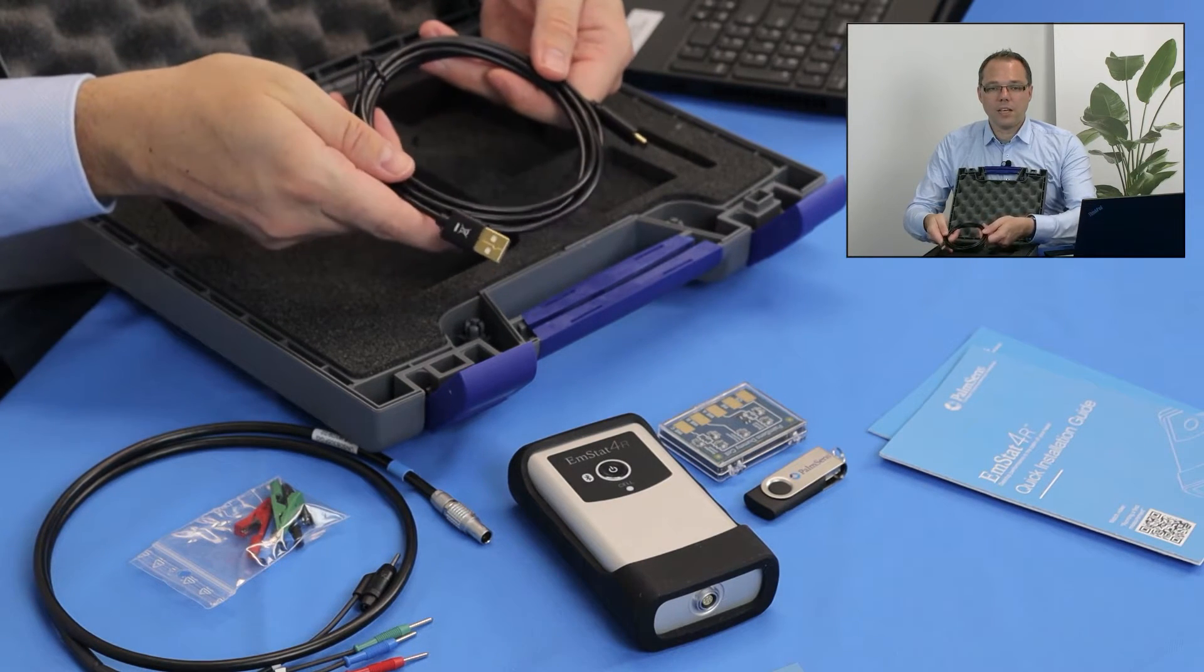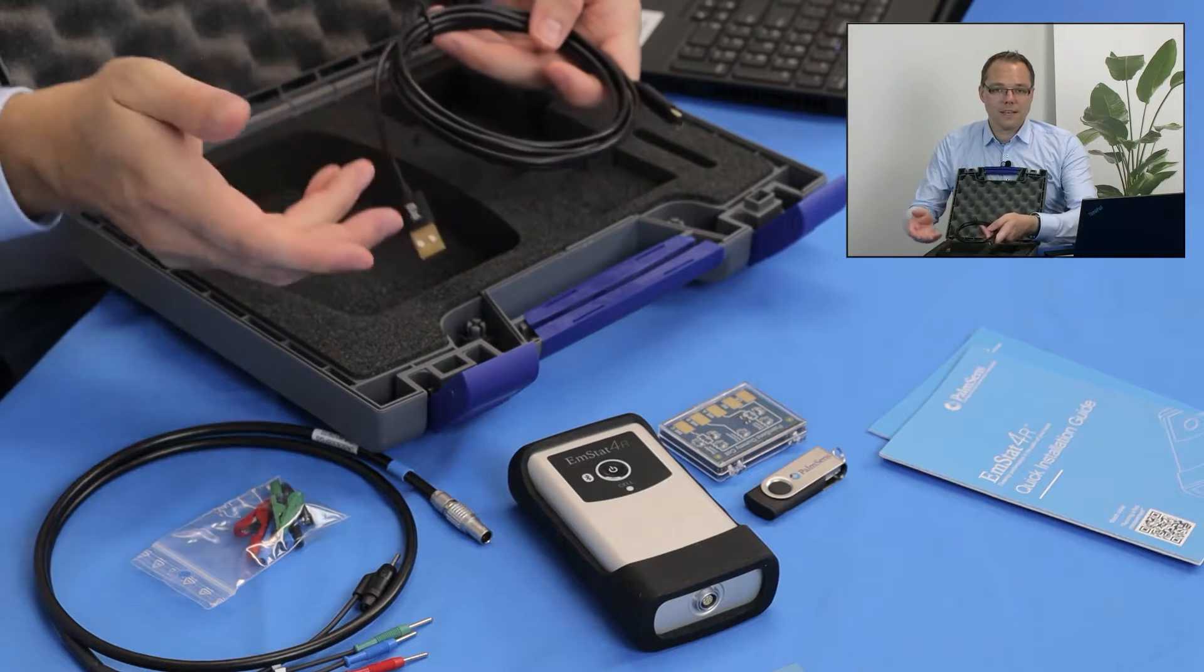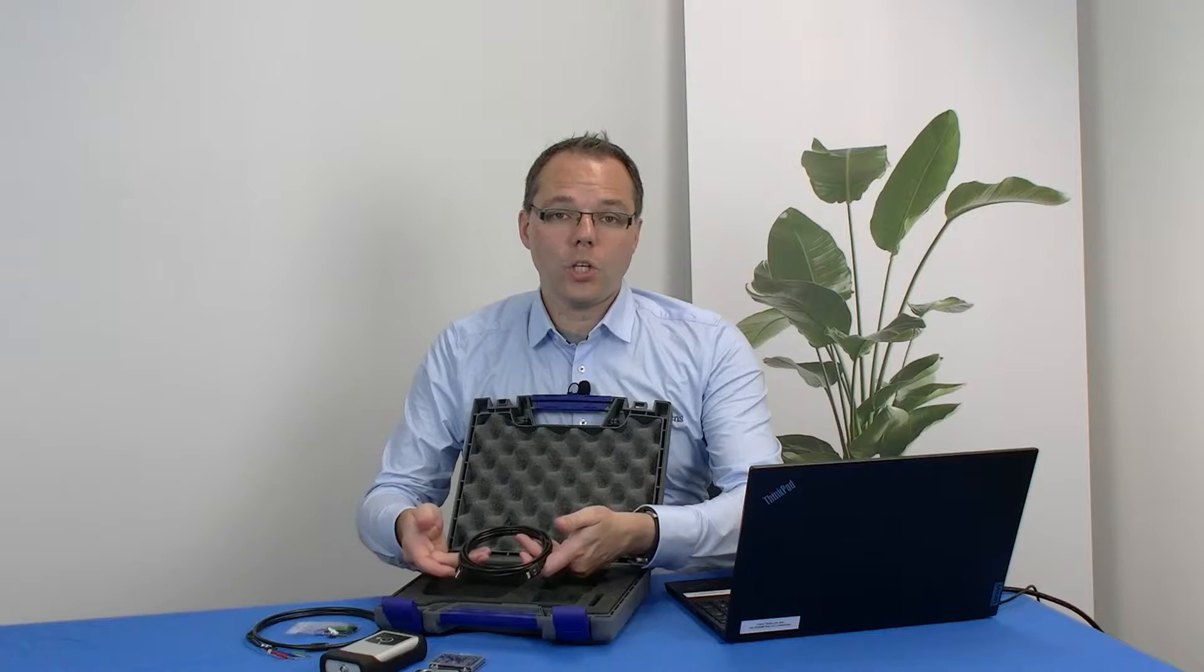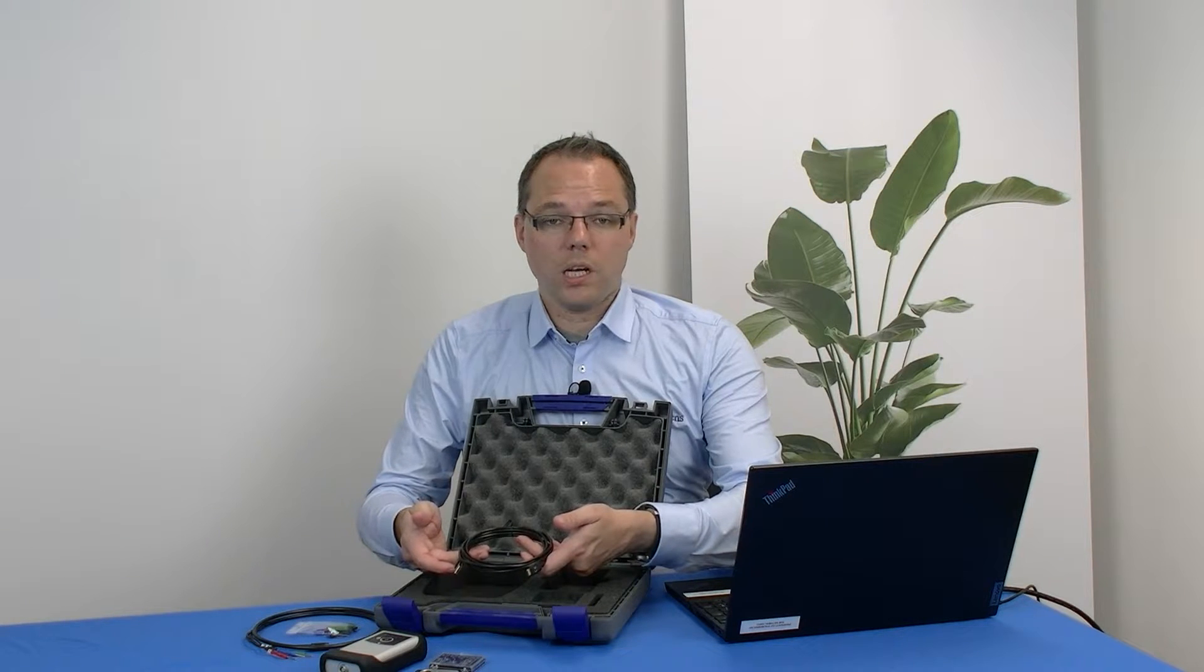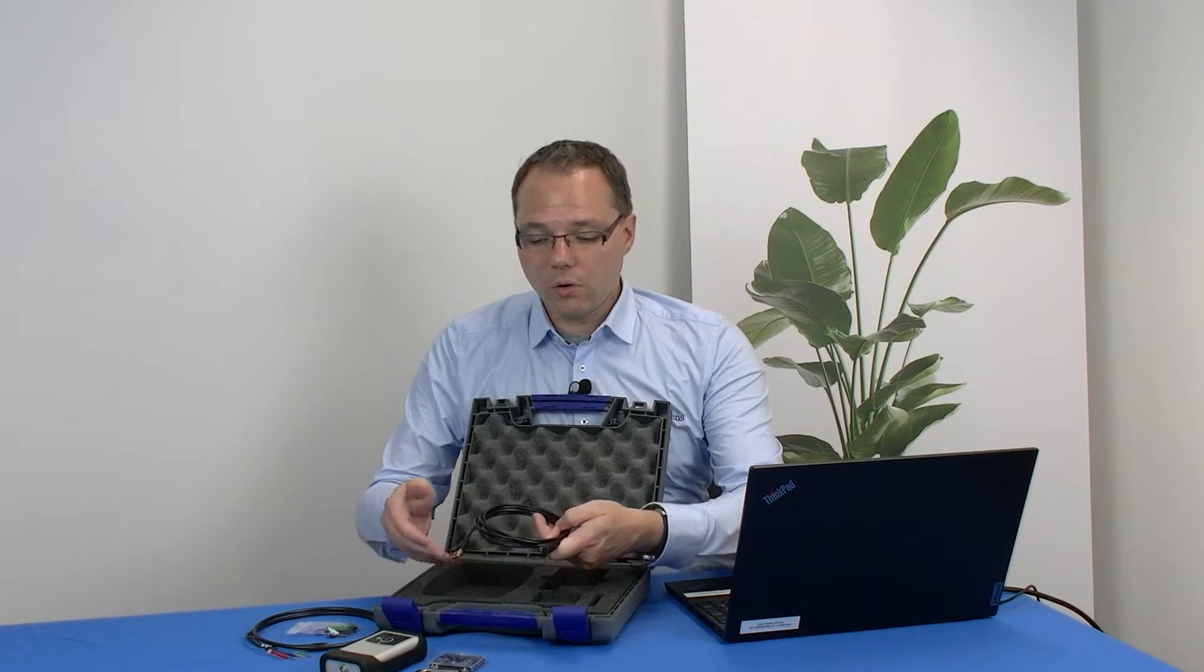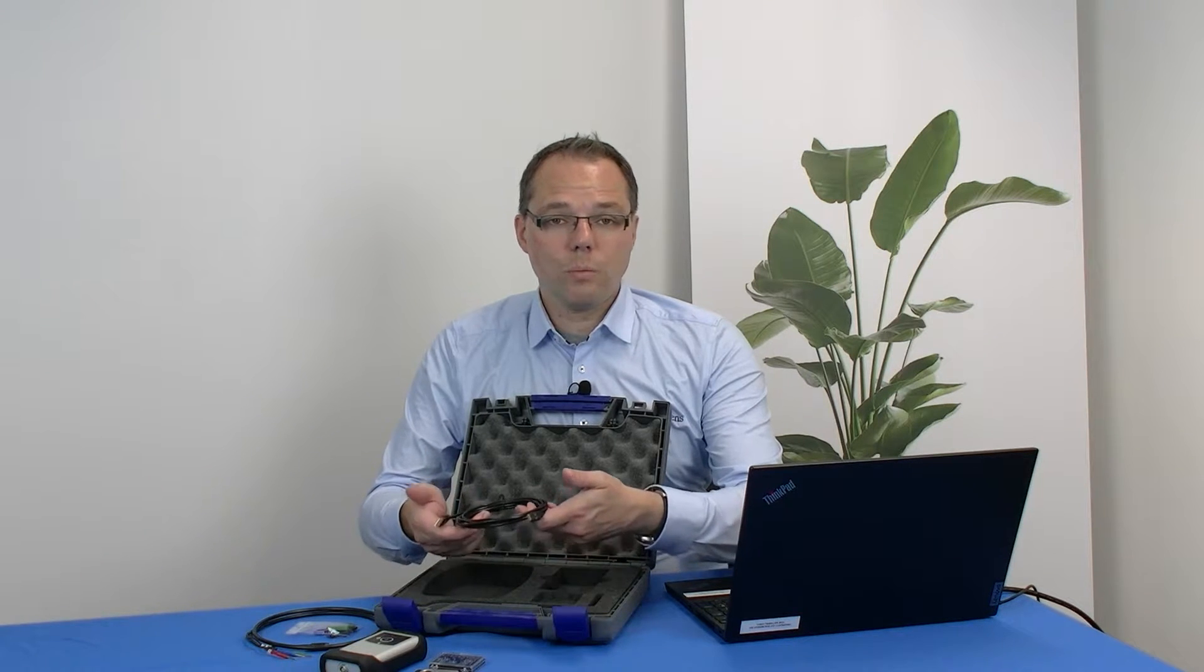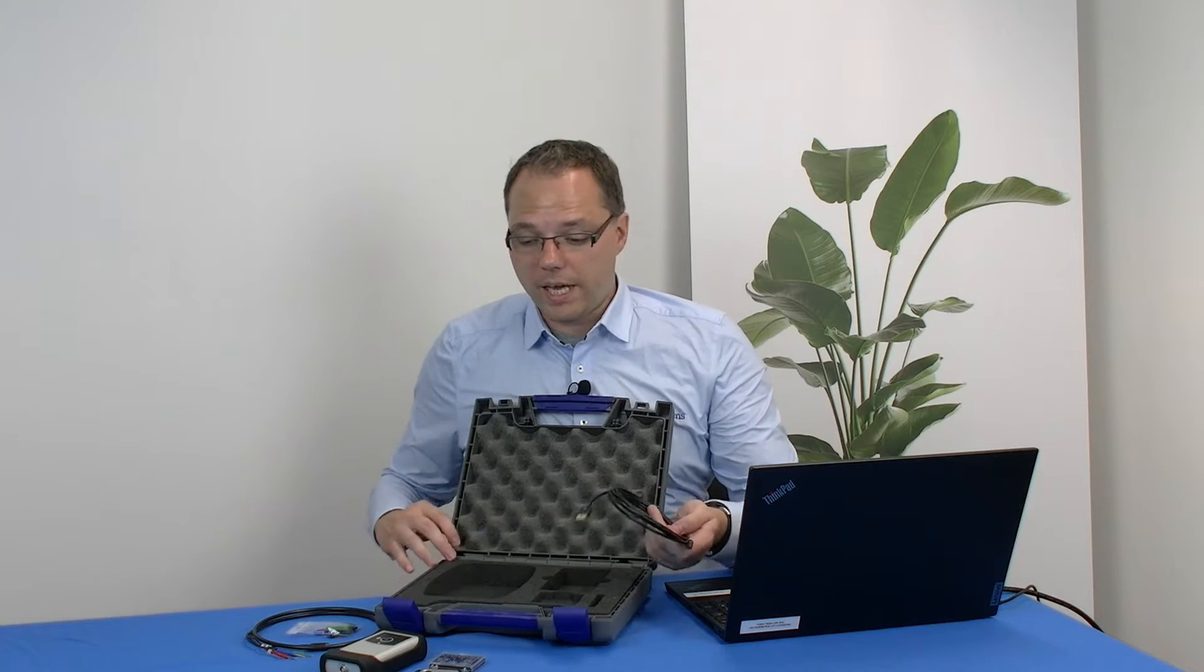Then you will find in there a USB cable. I said wireless operation, of course, because there's a battery, but at some point you will have to charge the battery. As an alternative, you can also just operate the instrument while it's connected via USB and do your power and communication through the USB cable.